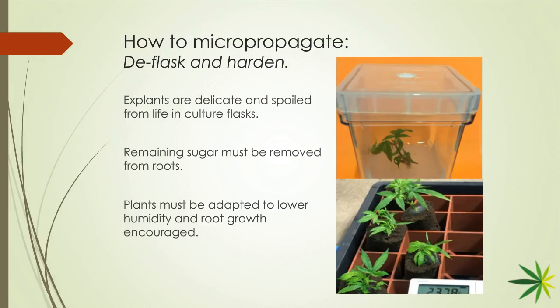I love that analogy. It's even more apt here, because you see that little culture container. That thing is completely protected from the outside environment. There's even a little filter on the top of that culture container that keeps anything bacterial from getting in. The only things that can get in and out are air and a little bit of water vapor. So it's living in a bubble. And there's all that sugar on it. You bring that out into the real world, leave all that sugar on it, that's just a feast for any pathogen or microbe that lands on it from the air.